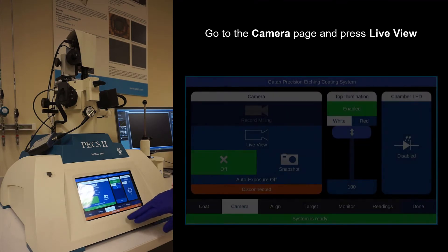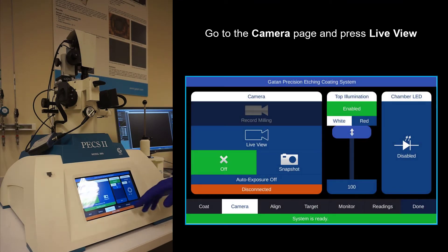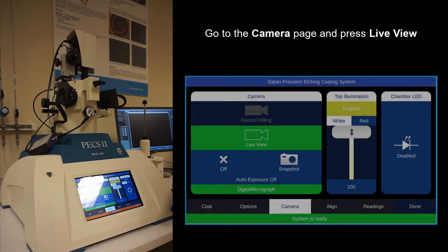Now go to the camera page. We won't actually be using the camera, but we would like to open the shutter so we can see inside the chamber. Select live view.